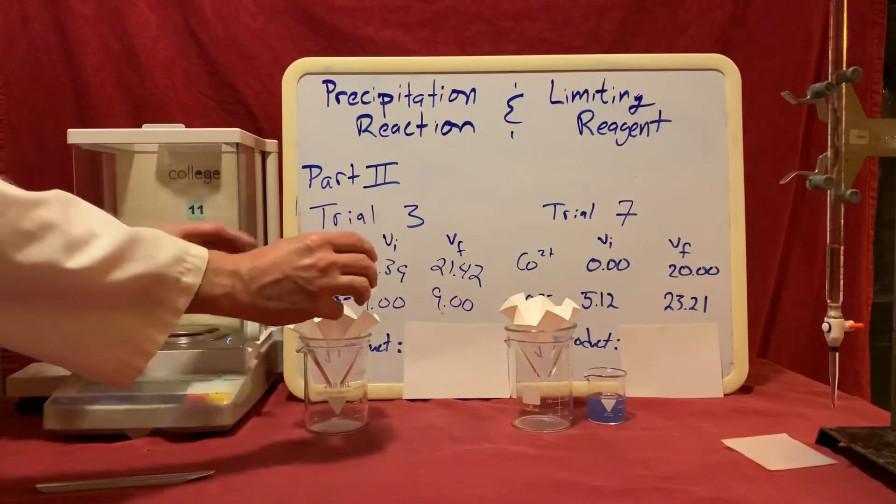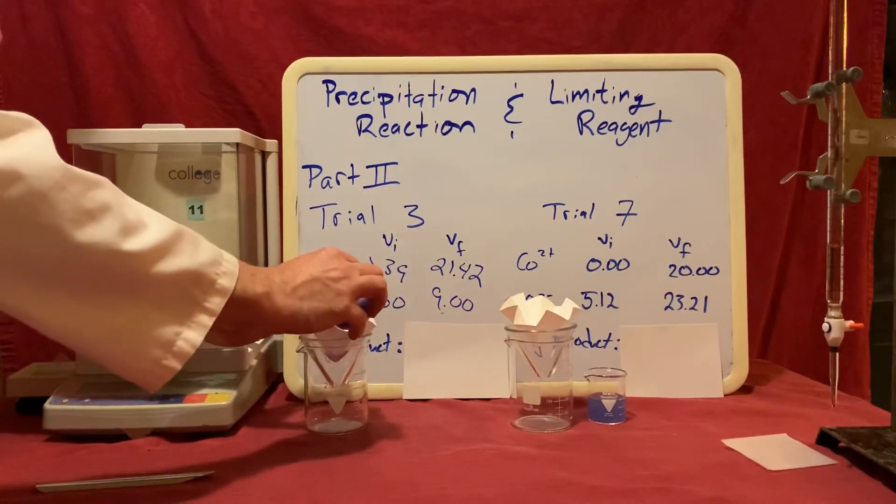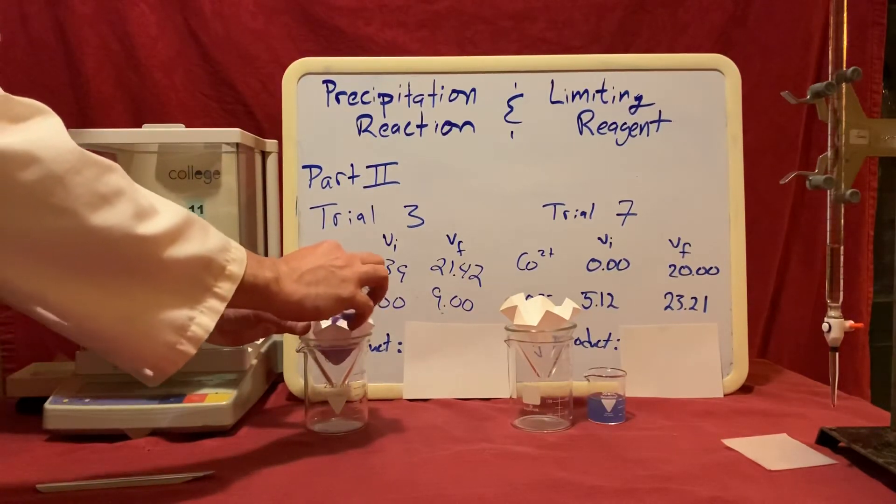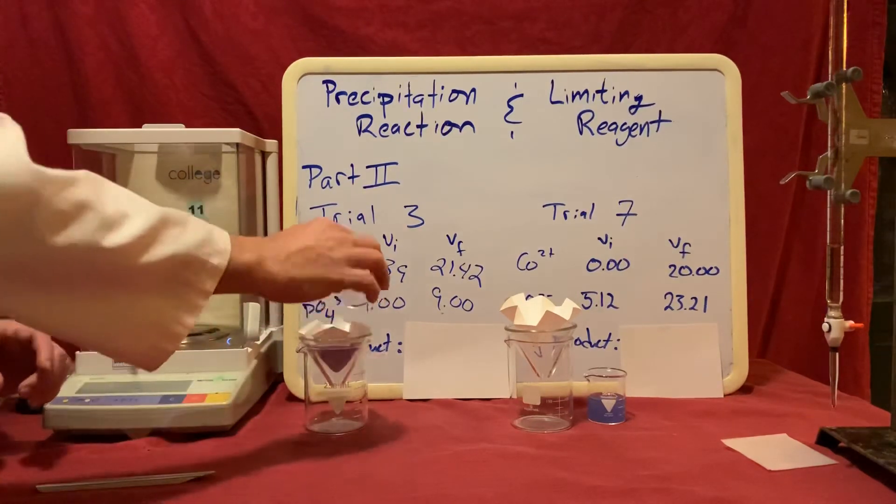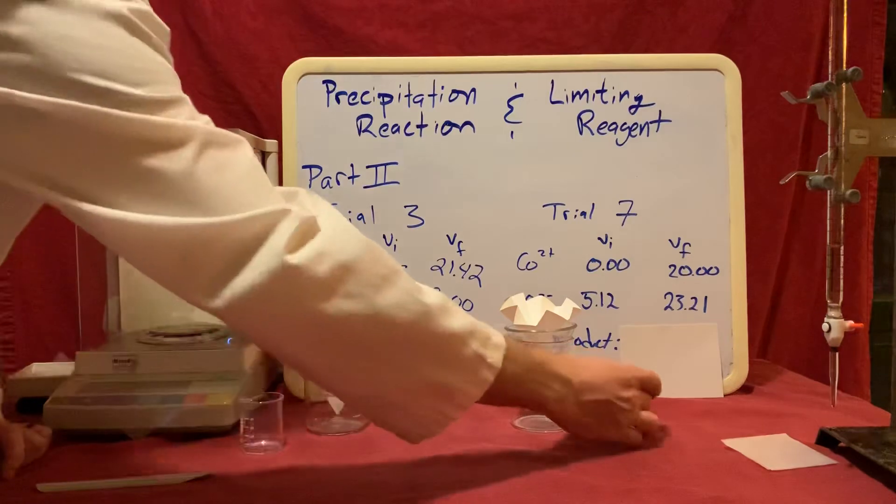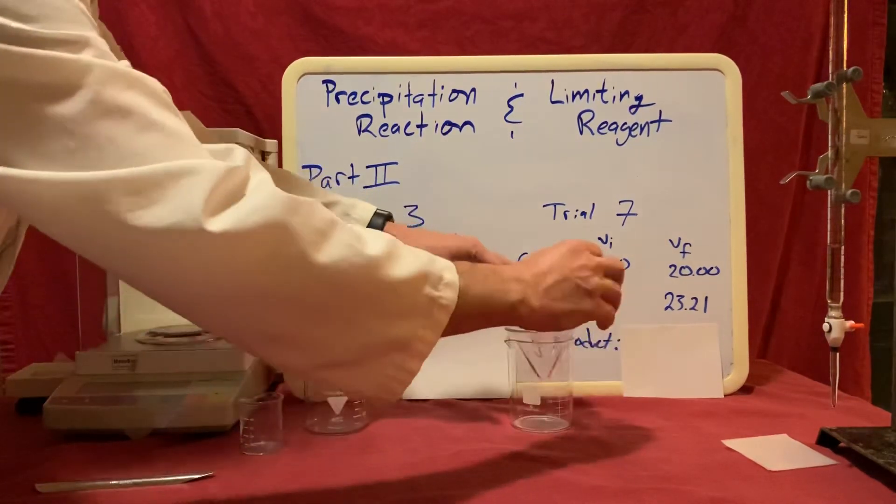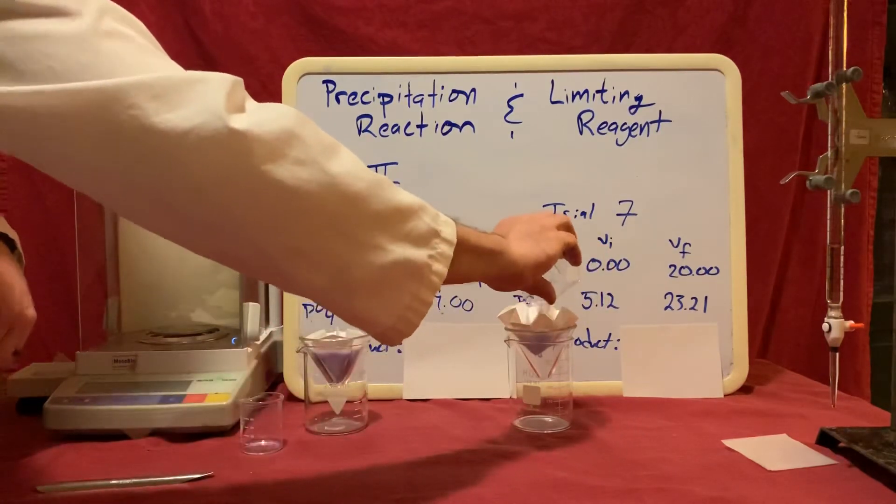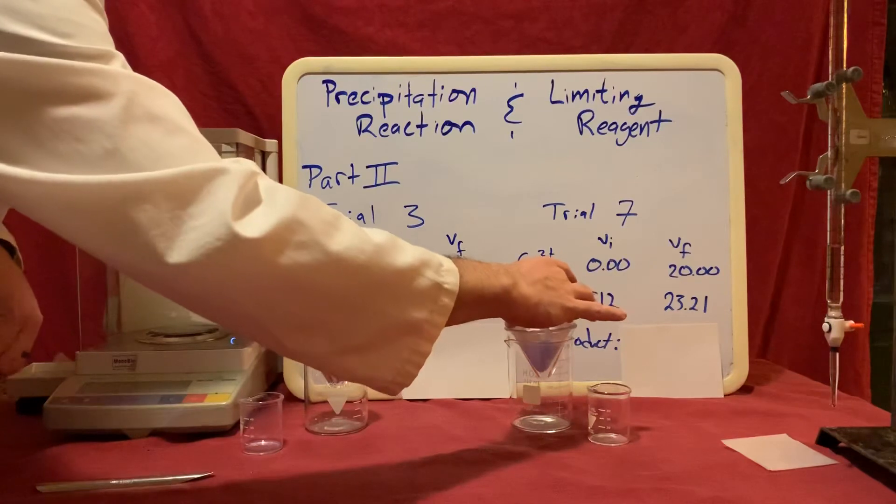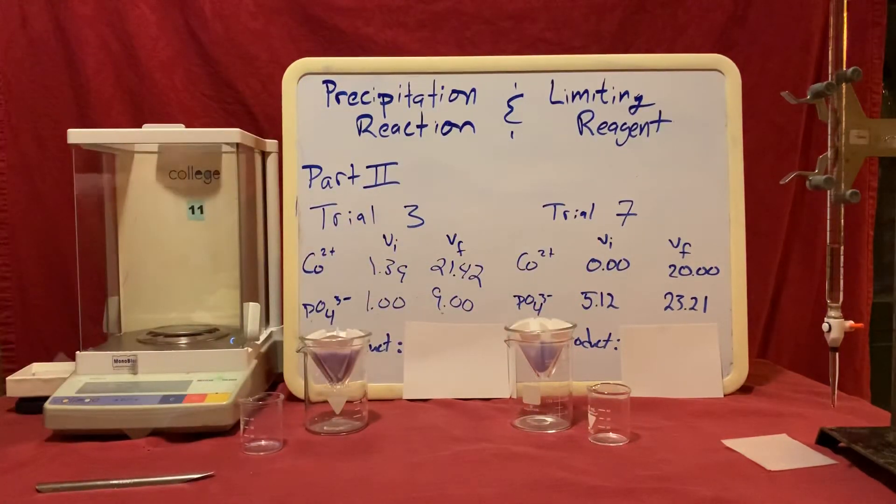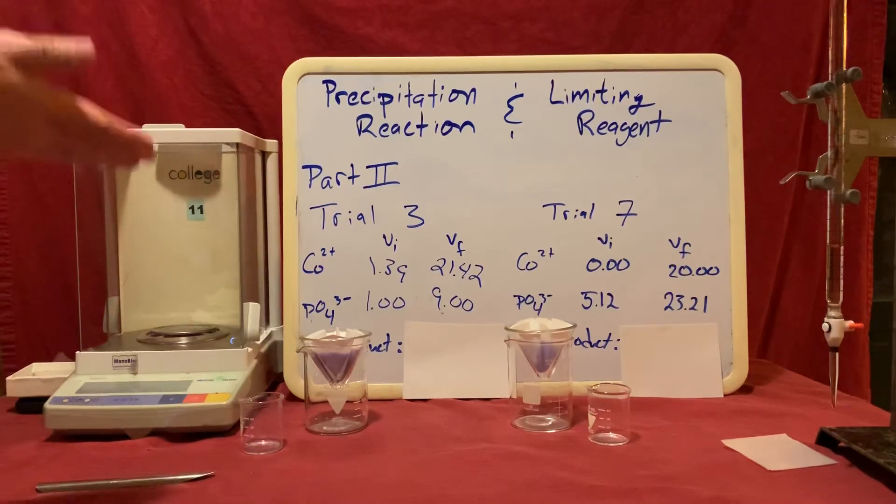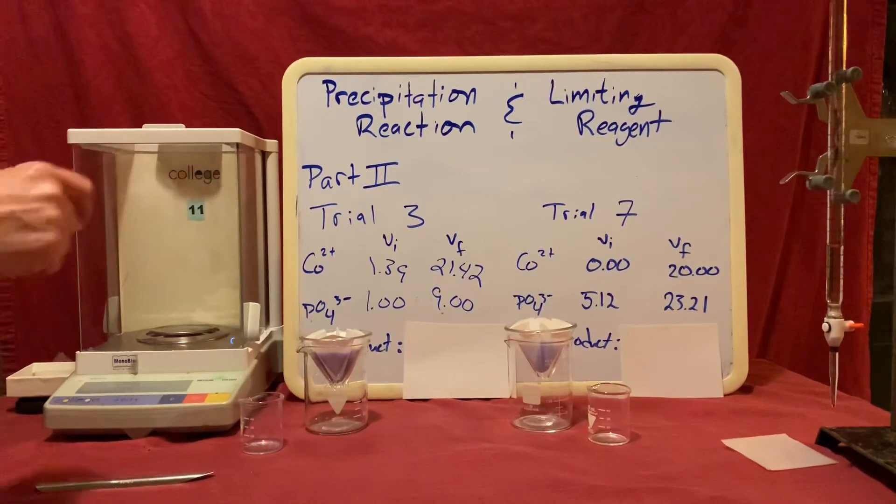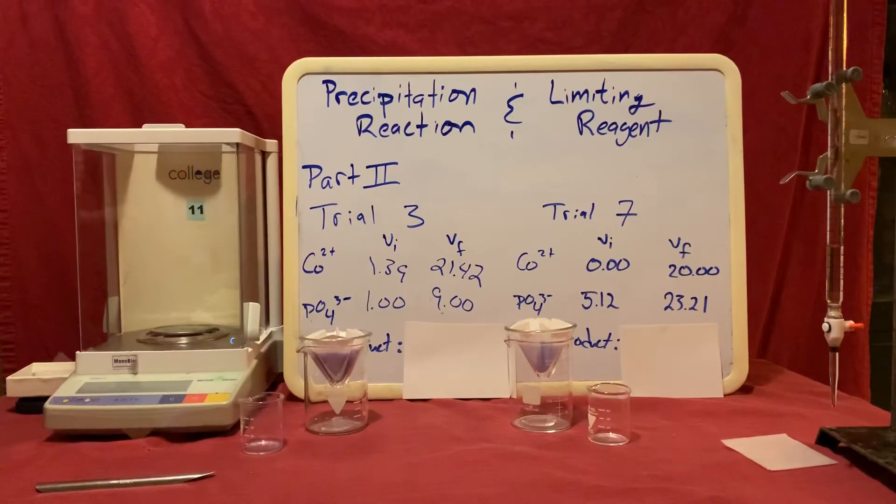I'm going to take my solid, I'm going to pour this through the filter paper and allow all the liquid to drain out. I'll do the same thing with trial 7. This filtration process takes some time. And once all the liquid here had drained out, I would add a little bit of deionized water to each one of my samples in order to rinse out any remaining solvent and diluted ions that it still contained.